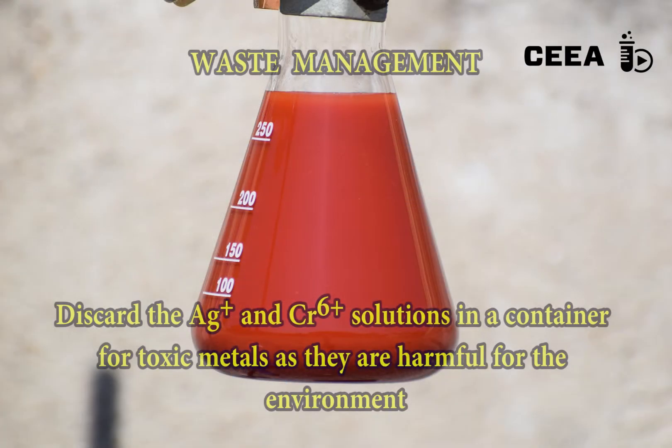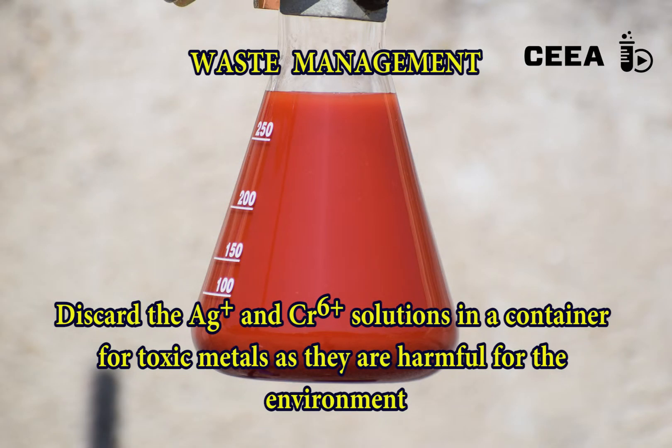Both silver and chromate are harmful for the environment. Discard the solutions in a container for toxic inorganic waste.